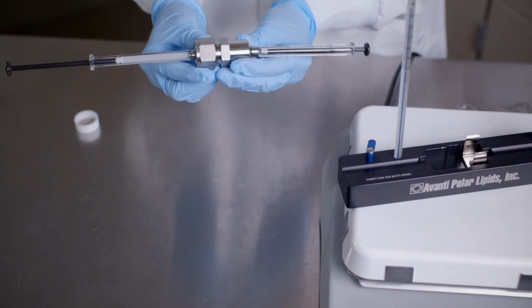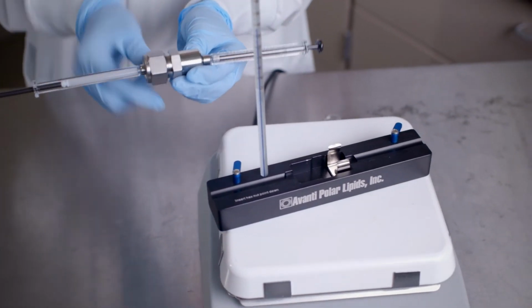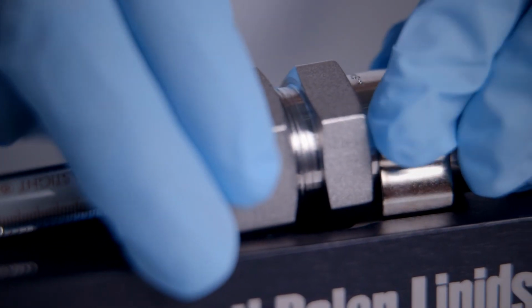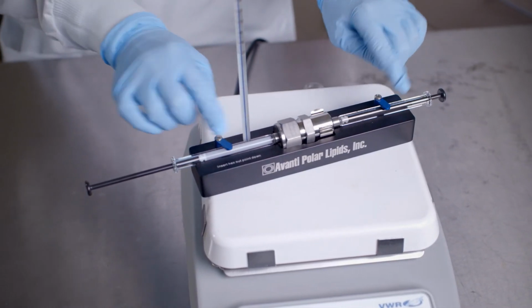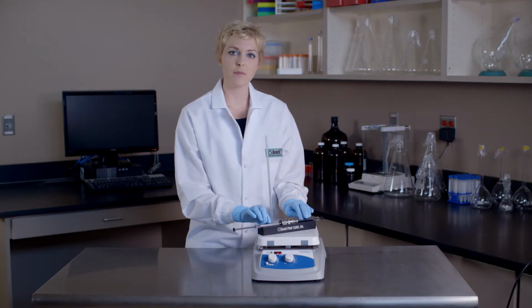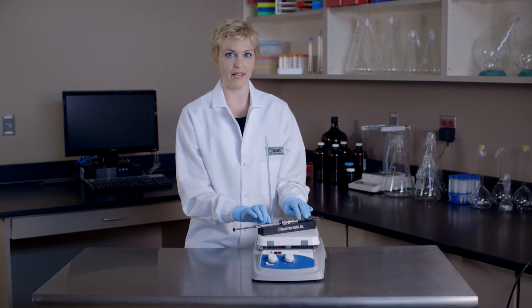Now we're ready to insert our fully assembled extruder apparatus into the heating block. Insert the hex nut so that any two opposing apexes fall within the vertical plane. Then use the swinging arm clips to secure the syringes into good thermal contact with the heating block. Allow the lipid suspension to equilibrate to the temperature of the heating block for approximately 5 to 10 minutes.